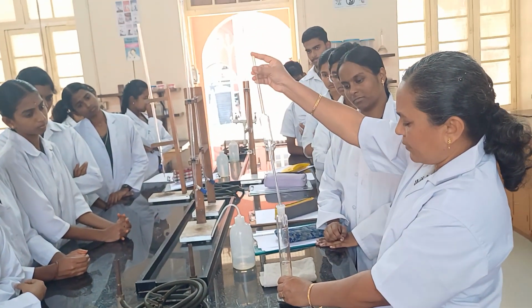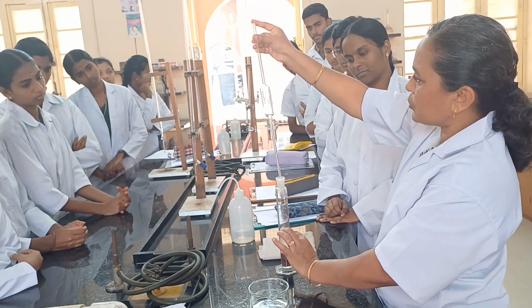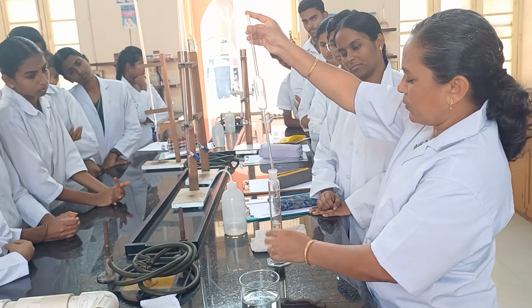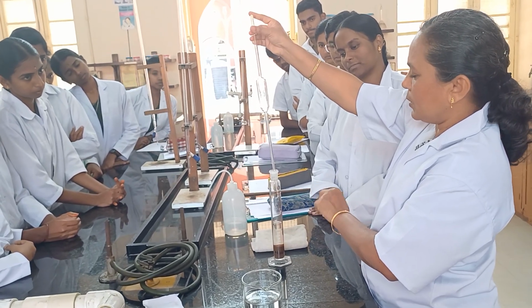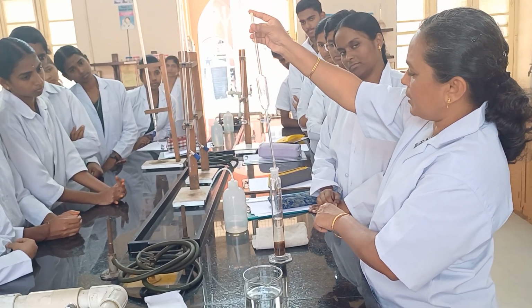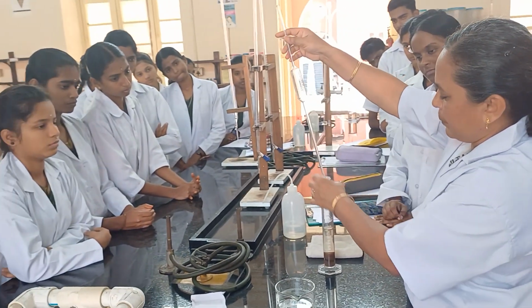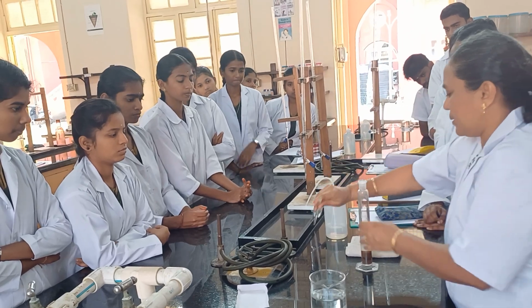While adding water, we have to take care that at least 5 cm of standing water should be there above the soil. At the same time, after adding water, the total volume should not exceed 100 ml. Then keep it undisturbed for 30 minutes.